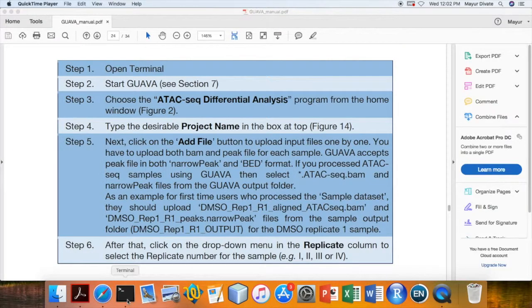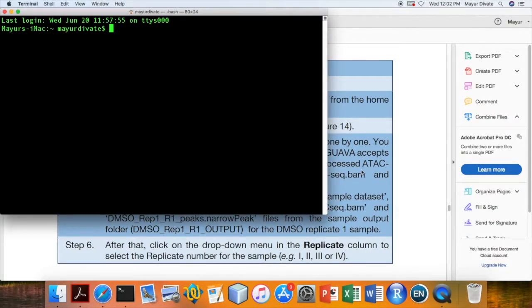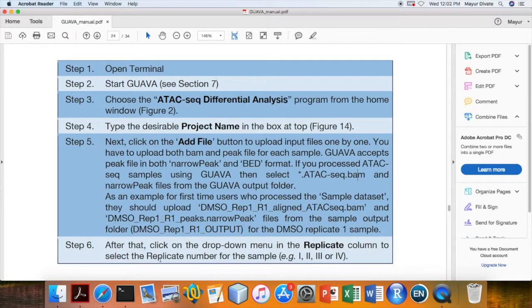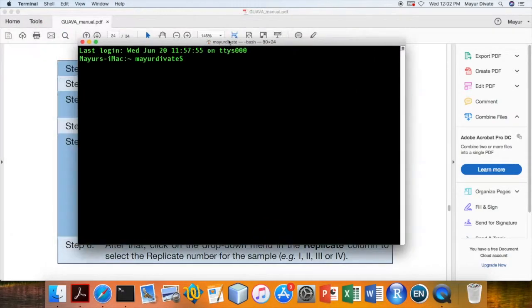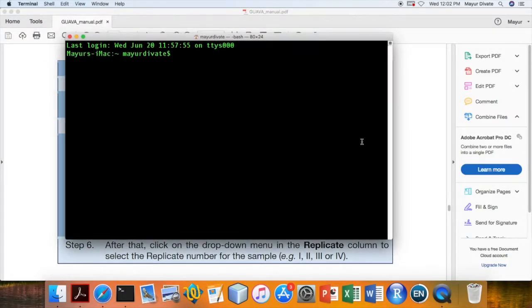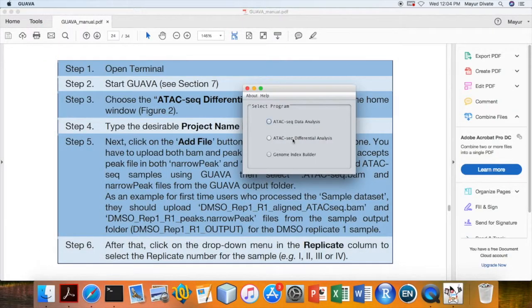First we will need to open terminal. Once terminal is open, then we will need to start GUAVA as shown in section 7 and then select the ATAC-seq Differential Analysis program.